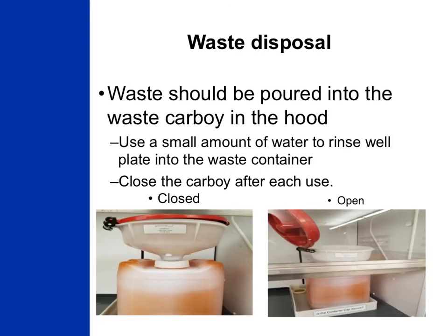As we are working with solutions containing transition metals, please make sure you pour all of your waste in the waste containers in the hood. As always, check and make sure that the lid to the waste container is open before you pour in your solution. If you need any kind of help or have questions, please make sure to speak with a TA in the General Chemistry Learning Center or ask the lab supervisor prior to coming to lab.